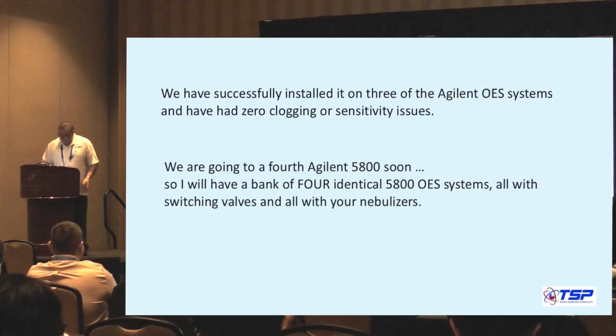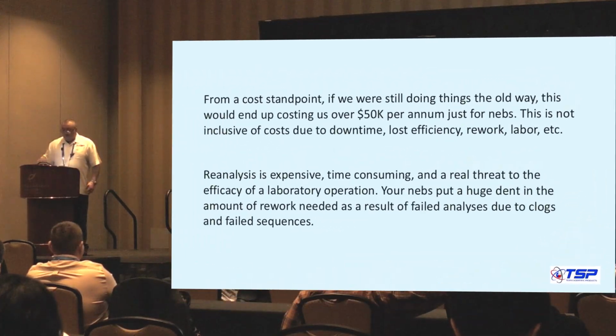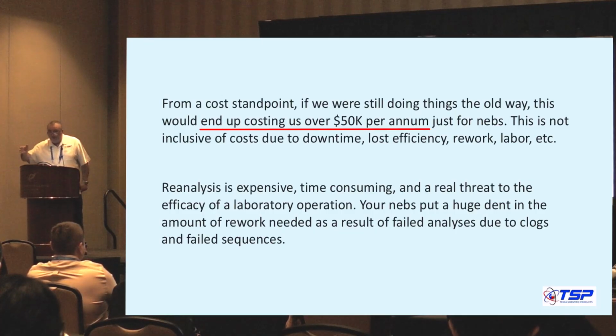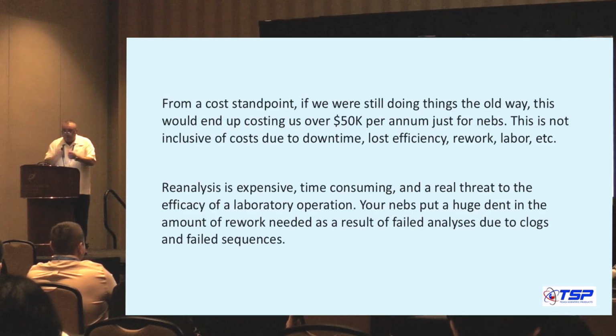From a cost standpoint, if some of your lab managers are here, we were still doing things the old way, which would have cost us $50,000 per year on the nebulizers only. They were going through 1 nebulizer replacement per instrument per month, because after it clogged, they tried to clean it, and then it quit on them. And then they go and buy a new one. This is what was happening, and it's happening not just with that, we see it all the time.